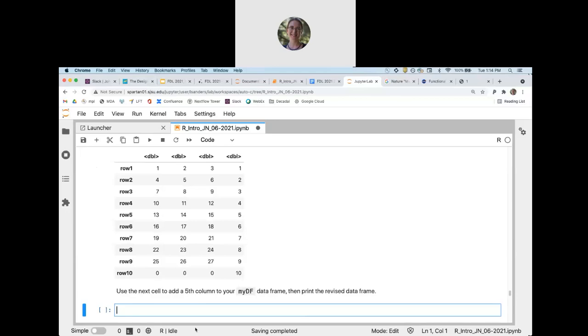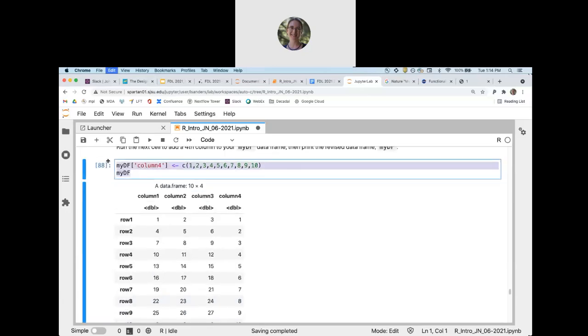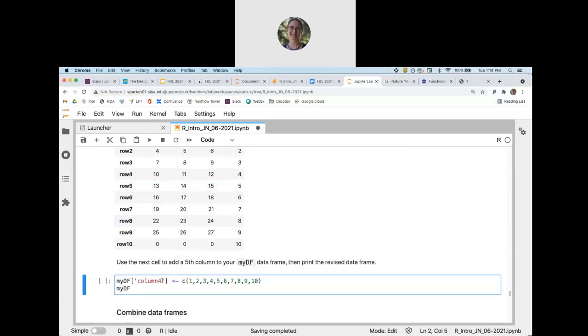Okay, excellent. People are putting innovative new columns in. Column 5. Very good. I'm going to do the same.